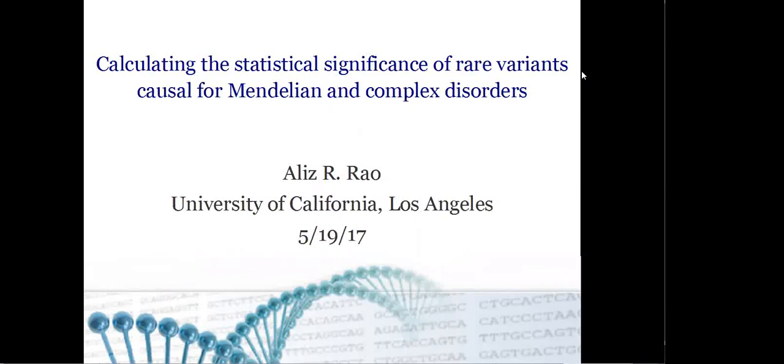Morning. My name is Aliz R, and I'm a bioinformatics researcher at UCLA. Today I'll be talking to you about a tool and methodology I've developed that allows researchers to calculate the statistical significance of their next-gen sequencing findings in studies involving Mendelian as well as complex disorders.